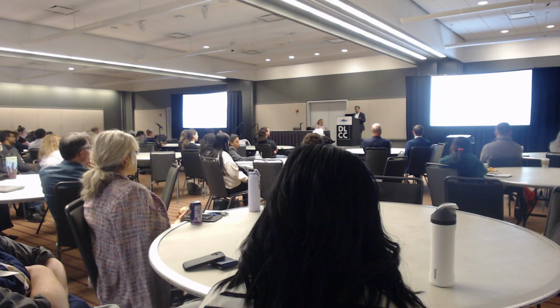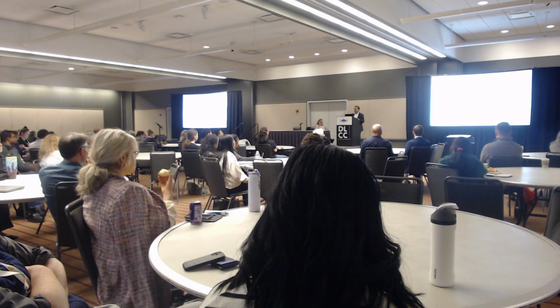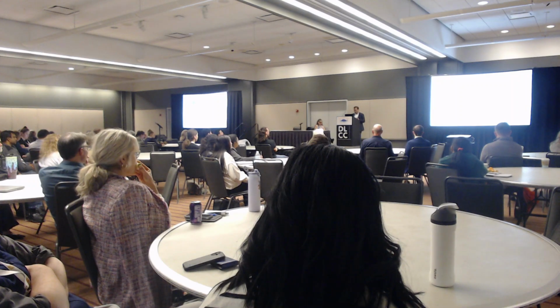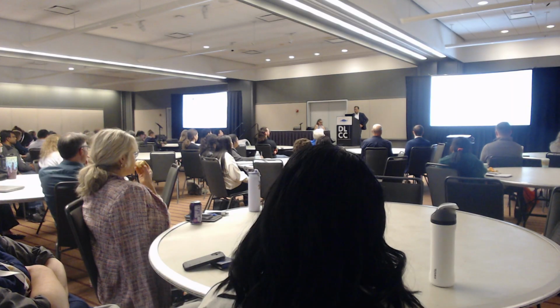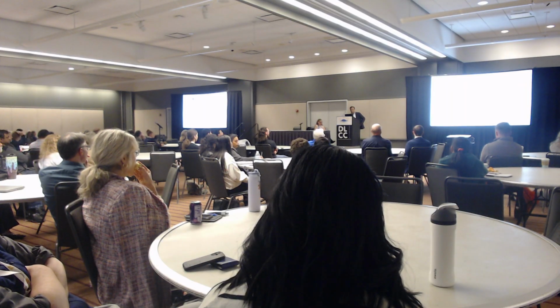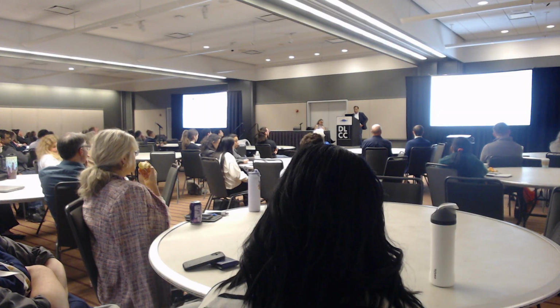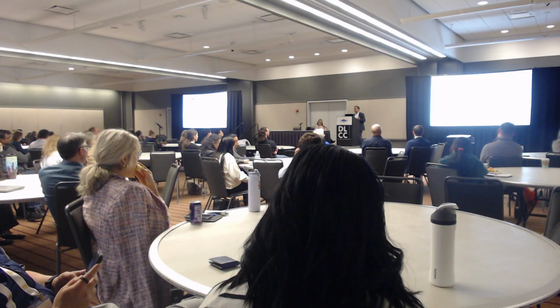So we basically are very interested, as a scientist myself. Claudia mentioned a proactive approach. So this was a very proactive approach. We wanted to have these assays available for our community, and once we have it, then they get to use it. So we partnered with Arima Genomics. Brenda and Andy have a very extensive offering, and I'm thankful for their support. So this is a very simple workflow. You have the cross-linked chromatin, you break it up with the enzymes, you ligate it with the biotin and fill in, and you shear and purify the DNA.